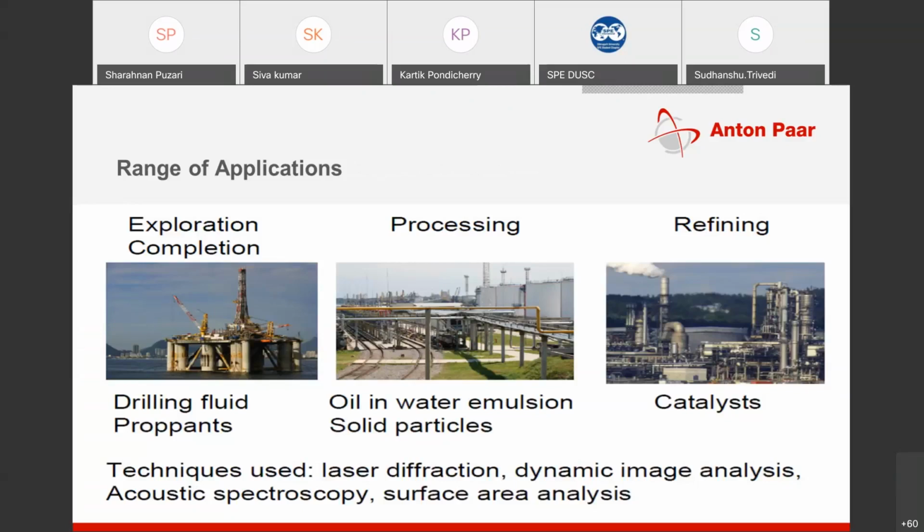When you are exploring or drilling fluids or proppants, you require particle size analyzers. For oil in water emulsions or solid particle processing, again you require a particle size analyzer. And for the catalyst, definitely you require a particle size analyzer. The techniques used for all these processes are laser diffraction, dynamic image analysis, acoustic spectroscopy, and surface area analysis. Basically, all these techniques are used in the entire process of petroleum. So I will take them one by one.